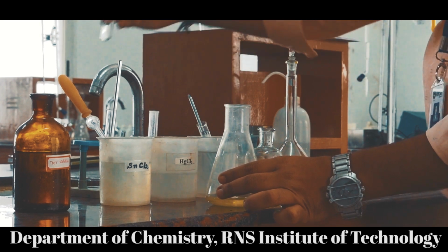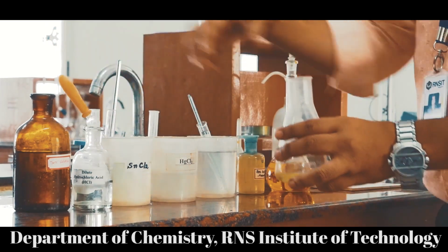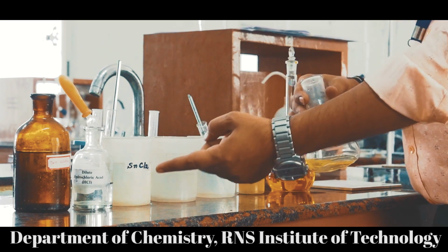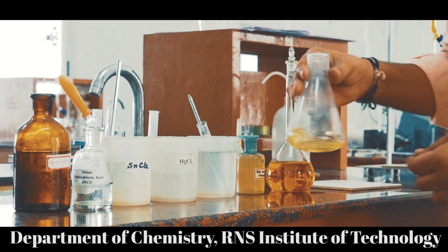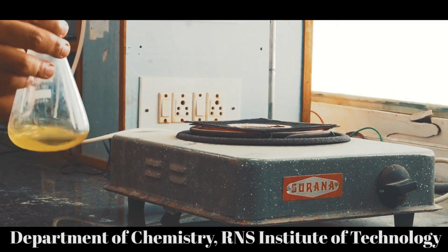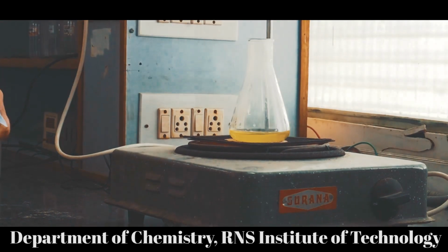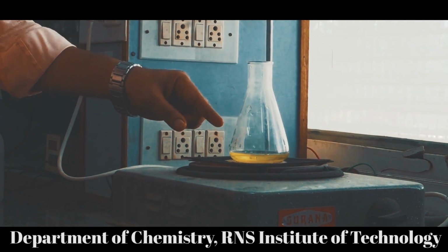Okay. So after adding this HCl, you need to heat the solution until it starts boiling, because stannous chloride should be added in the hot condition. Now let us go for heating the solution. This is the electric stove, on which we are going to place this reaction mixture. So for heating, we have to keep this solution until it starts to boil.